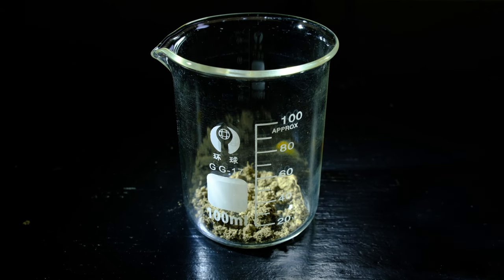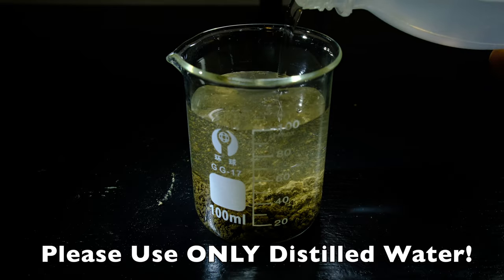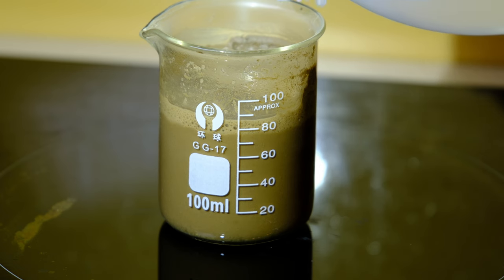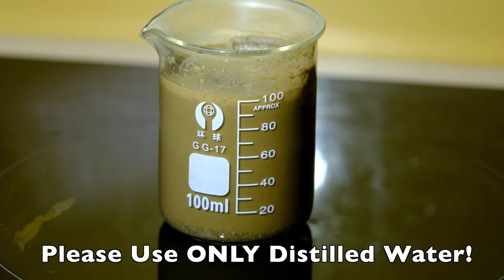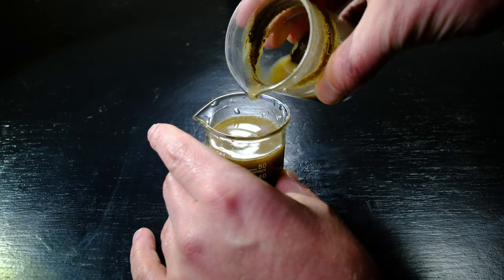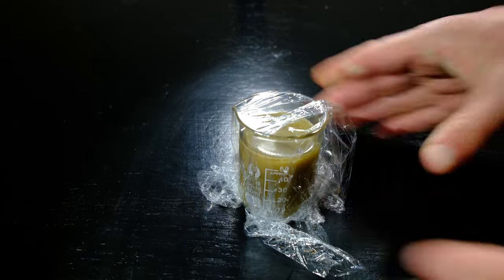Take a beaker and take the soil. Cover the bottom of the beaker with at least 1 centimeter of soil. Top off the beaker with distilled water. Boil for 2 to 3 hours. The evaporated water has to be replaced constantly. Keep it level at 100 mL. After the beaker is cool enough and the material has settled a bit, decant the murky liquid into a second beaker. Cover the beaker containing the liquid and set it aside for 3 days.